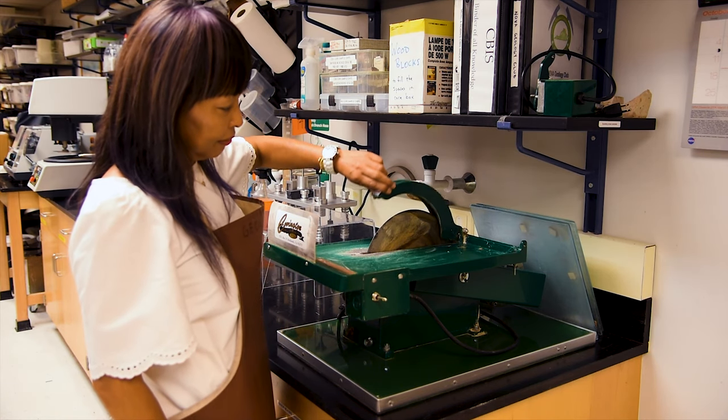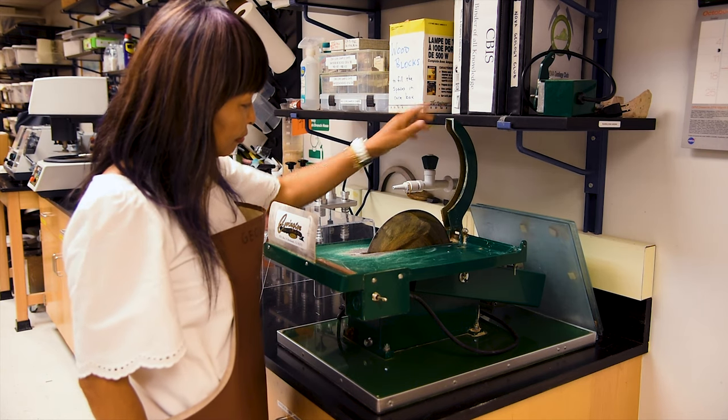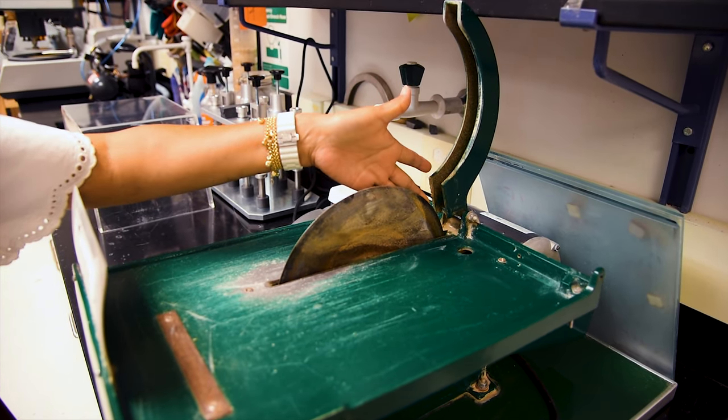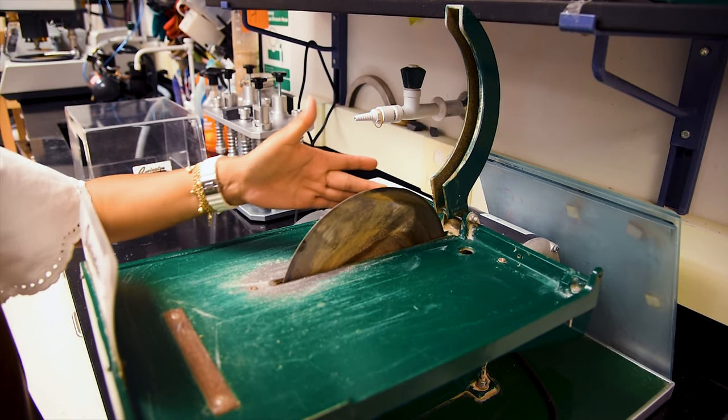The saw blade itself does not have a sharp edge, but a diamond impregnated edge with grooves. This helps increase the cutting rate and the contact of water with the rock sample.